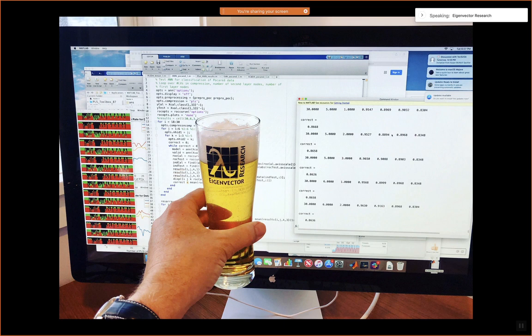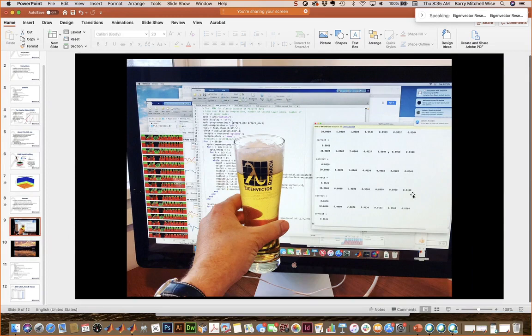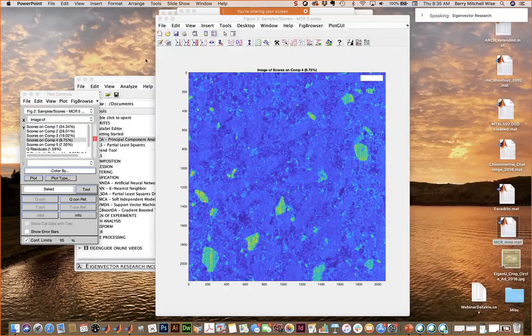In the webinar from last week, Rasmus displayed spectra with the included variables colored, but the excluded variables displayed in gray. How does one create such a plot? By default, the excluded data is not plotted. Okay, I could do a really quick example of that if you like.